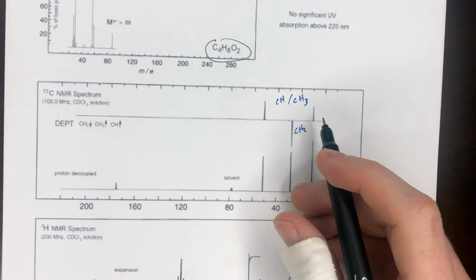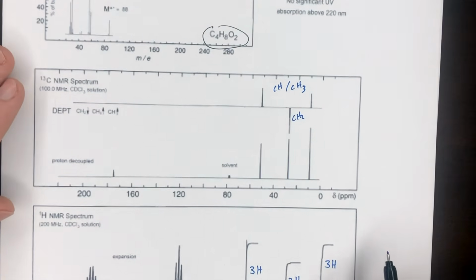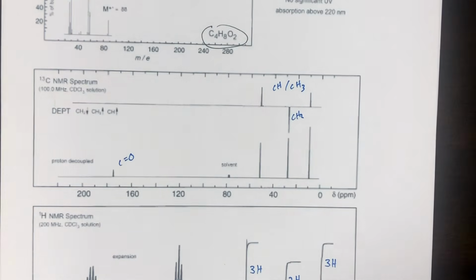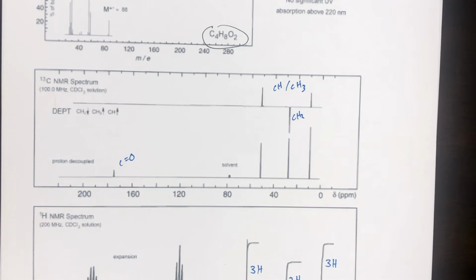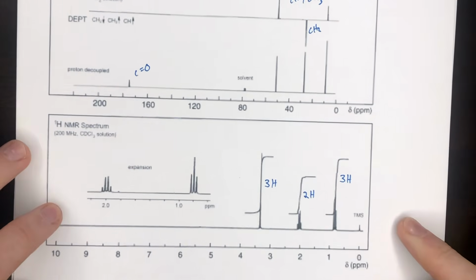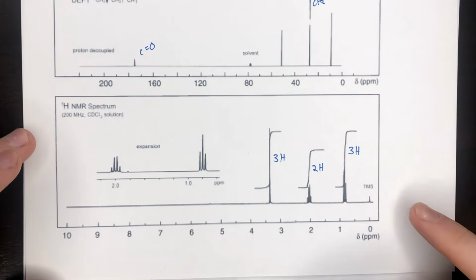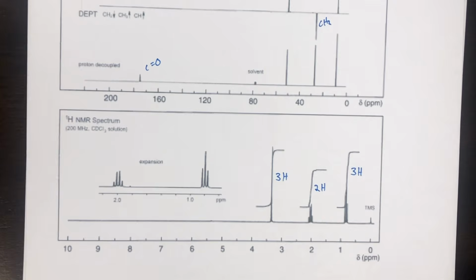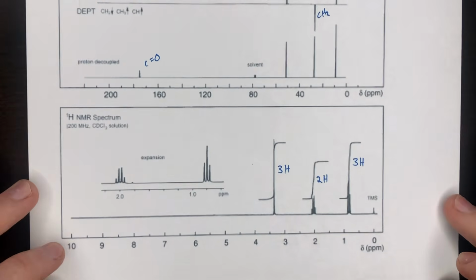So that will tell us some information about the chemical nature of that particular carbon. And then lastly, we see the carbonyl, again less than 200, around 180, 175. So that is consistent as well with not a ketone. So this could be an ester. We will have to see from the proton NMR if that's consistent. Okay, so now we're at the proton NMR. Again, I'm giving the hydrogen integrations instead of doing the math and measuring with the ruler here. But again, it's the same formula, same type of thing that we did in the first question.